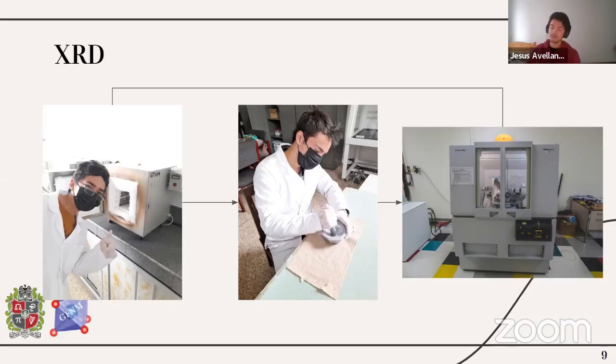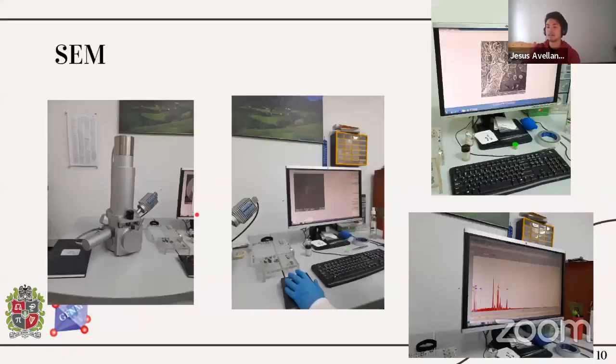As my partner said, after each sintering process, we also ground the sample for roughly half an hour, and the resulting powder was sent to the XRD lab. This cycle was repeated for all the sintering curves. But complementary measurements were also made to help our understanding of the initial XRD results. As you know, there's no single measurement that gives us a complete picture or all the answers we want when we are studying materials science.